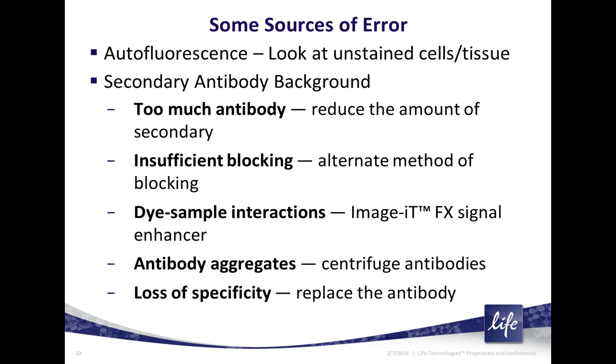And some dyes just go bad, or some antibodies just go bad over time. Most of our antibodies have a guarantee period of 3 to 6 months. So you want to check with your distributor, find out what their recommendation is for storage and stability time. If it gets too old, you start losing specificity and increasing the background until finally you get no labeling at all that's specific.